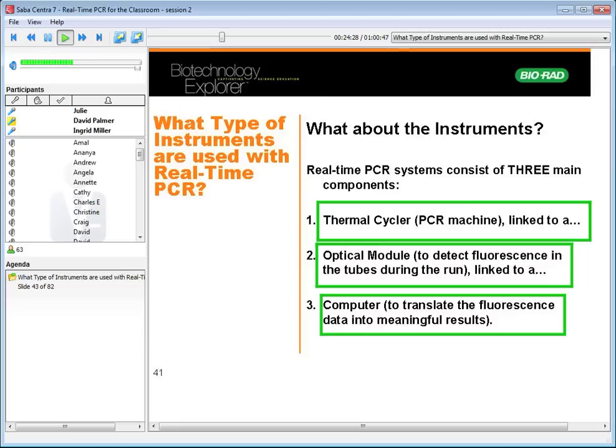So without knowing anything else, we could do some quick back of the envelope calculations here. If we take 18.69, which is about 18.7, subtract 8.9, the CT value of the other well, that comes up with roughly, say, ballpark 10 CT units between the two wells. A doubling every CT unit, so 2 to the power of 10, that's equal to 1024. So without knowing anything else about these wells, right away with those CT values alone, we can say there's about a 1,000-fold difference in concentration between the starting DNA of this one on the top and this one near the bottom. That's really the core of the calculations that come in real-time PCR, is just relating those CT values and the difference between them with a doubling every cycle and just calculating it out.